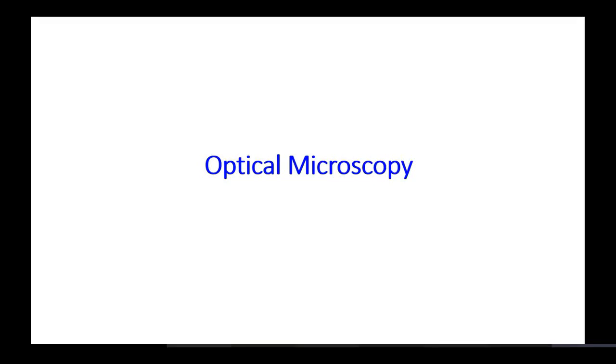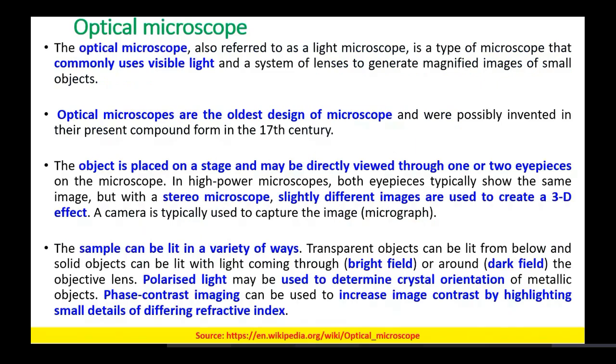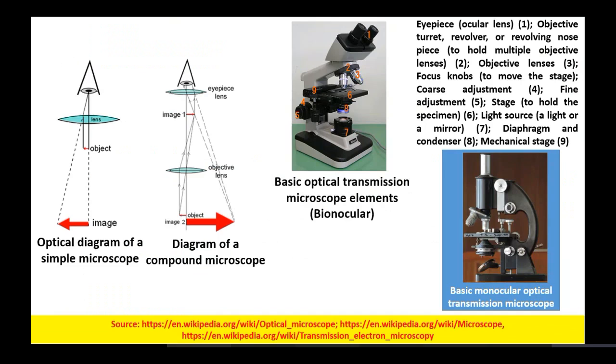Everyone. Today we will be continuing with optical microscopy. In the initial class, just a recap, we discussed the basics of microscopy. We talked about the different types of optical microscopes. Then we talked about the mechanism of optical magnification of objects.